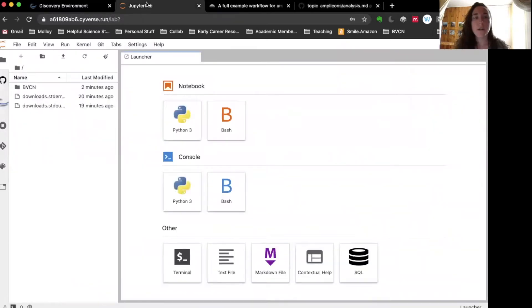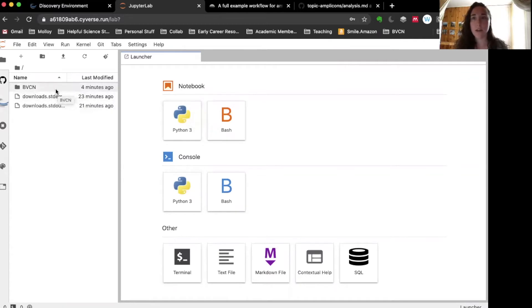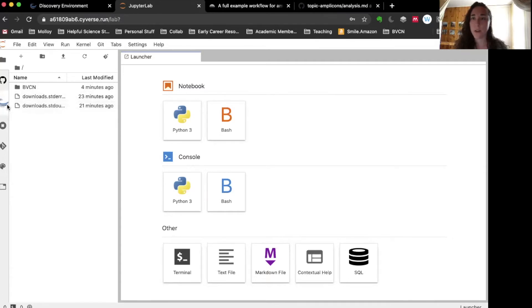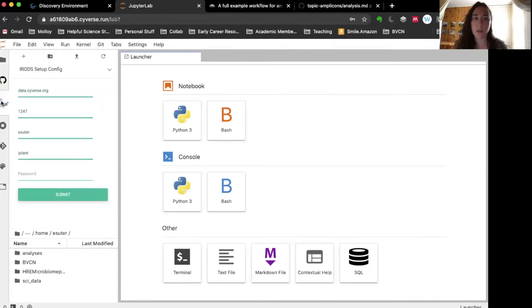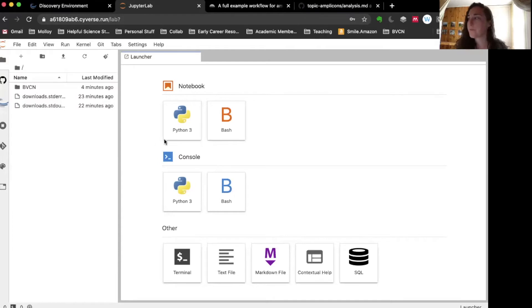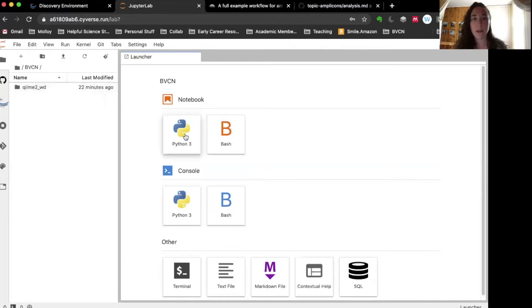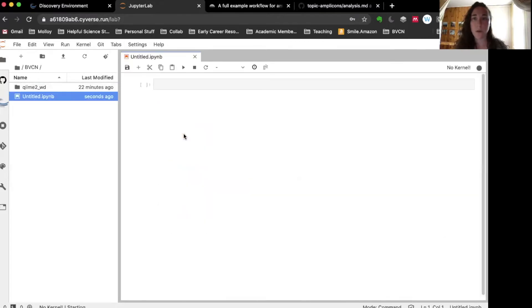If you followed along on CyVerse, you're probably in an environment that looks like this. We have a Python 3 notebook which has particular tools set up in it already for using QIIME 2. I directed the discovery environment to open up a folder that I called BVCN because I have data files in there. Also, if you're in this CyVerse environment, you have to make sure that you initialized your connection with the data store, which is explained in the other video.